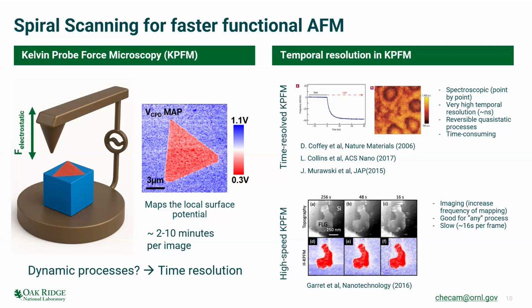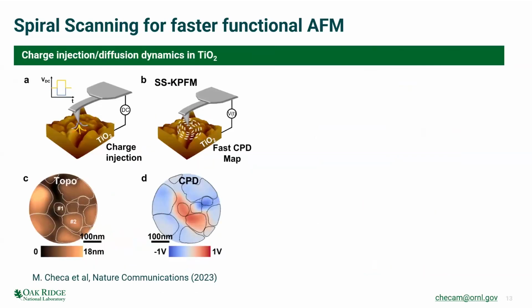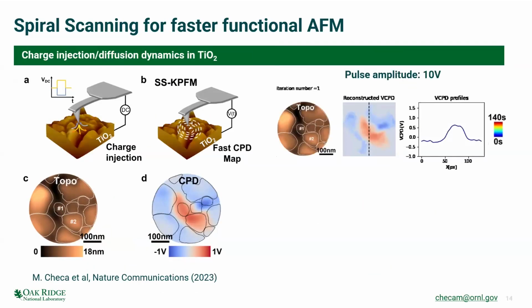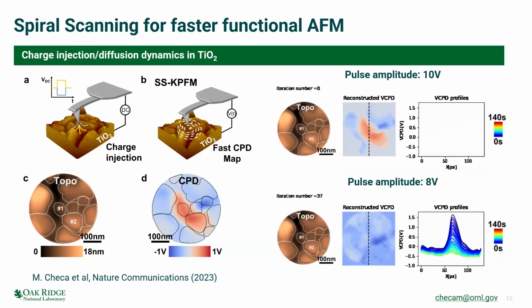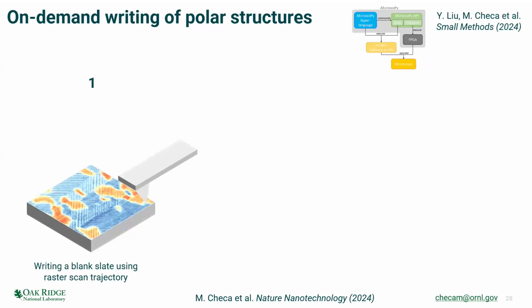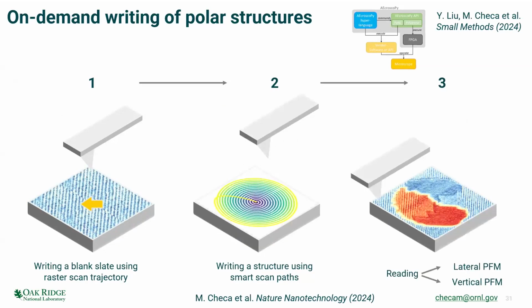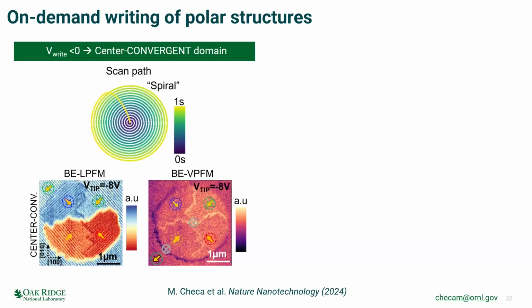More questions? So then I will give a couple of questions. I am still curious. I think that I already asked you this, but when you write, let's say, the domains that are like this, you see that in the middle, the out-of-plane signal is brighter, no? And then you say, okay, it is like that. And for the other chirality, it is negative. But when you write this flux-closure, you also see this bright and dark image. Do you know why they tilt out, if they do?